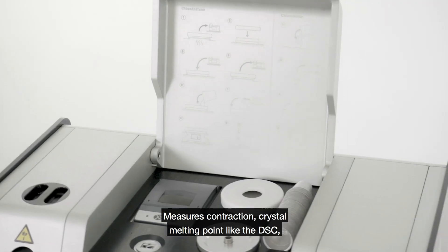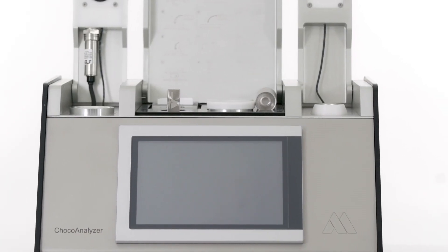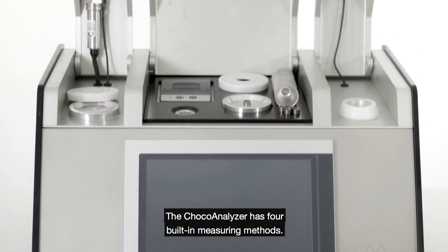Measures contraction, crystal melting point like the DSC, and the tempering index — all in one instrument. Easy to use and no specialists needed. The ChocoAnalyzer has four built-in measuring methods.